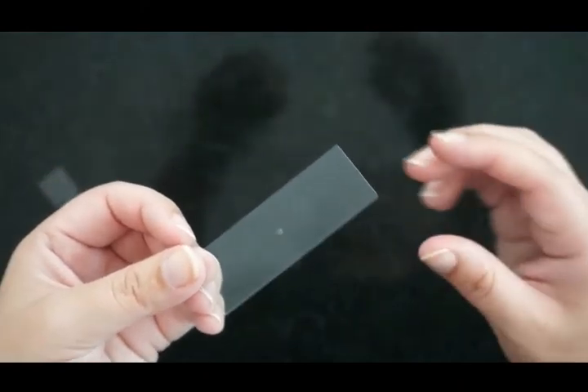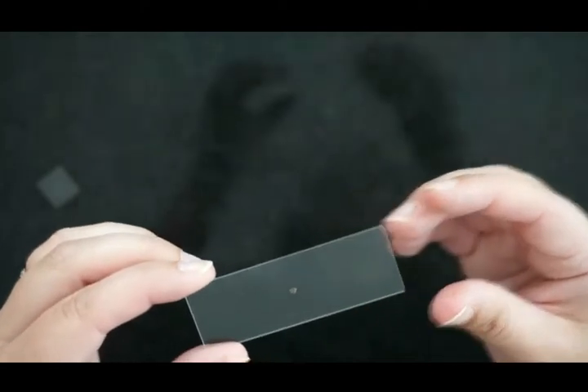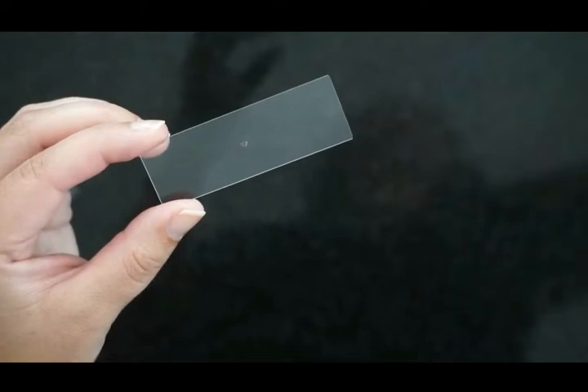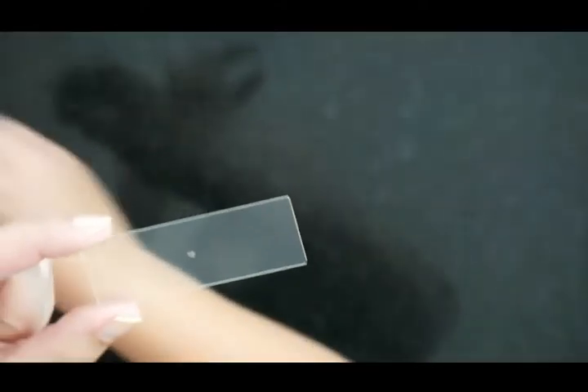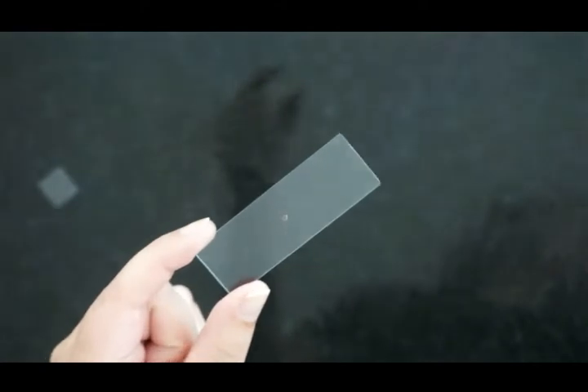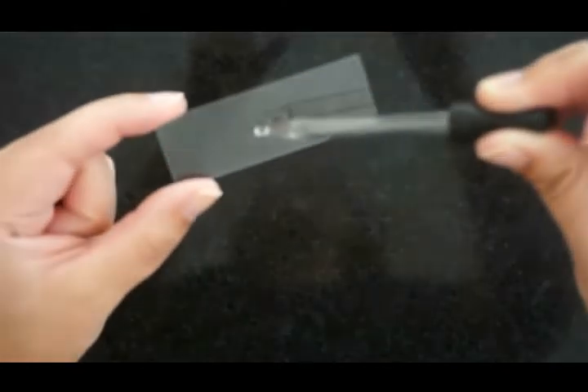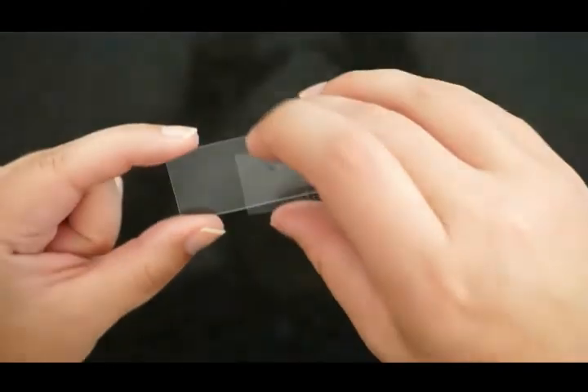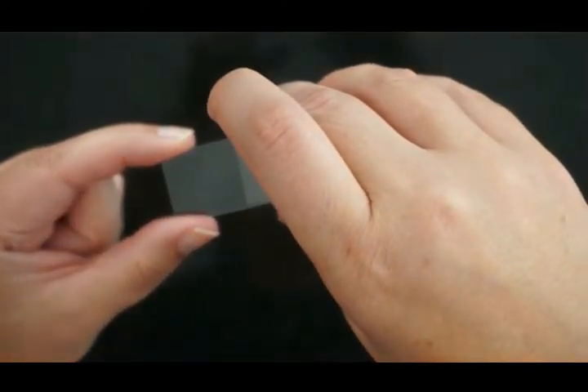You're going to add one drop of water to that, and then put your cover slip on top. Try to drop it from an angle, one side to the other — that squishes out some of the air bubbles.